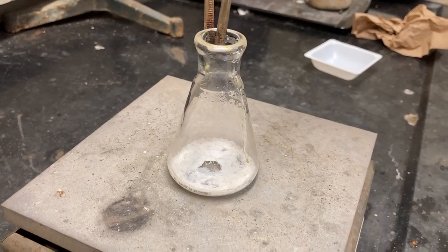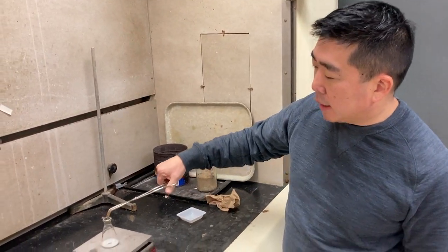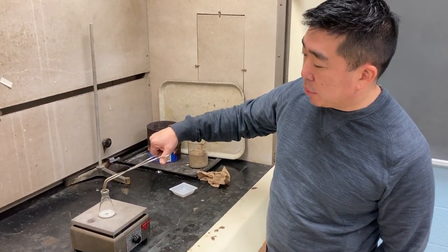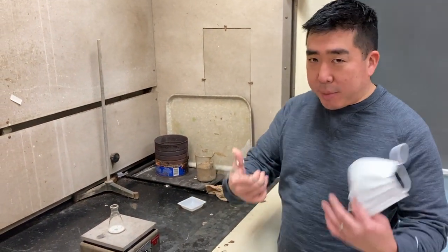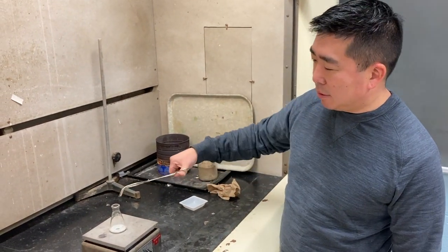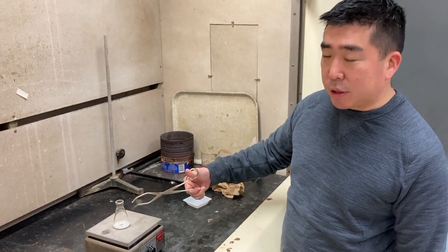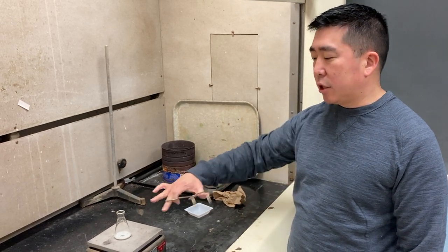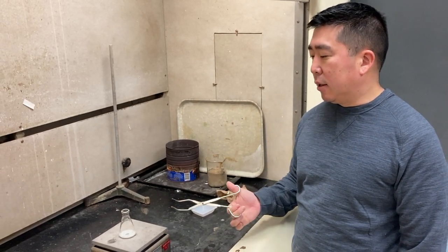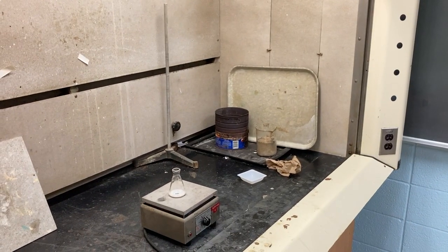Wouldn't they just dry if we kept it on the plate? You know what? In a normal lab environment, we would be drying this over a hot plate or a Bunsen burner, but that's because in a normal period we don't have that much time. With the magic of time-lapse video filming, we can take this nice and slow, and we'll get better results this way if we just let it sit on the hot plate. That's actually a gentler way of heating it, and we should get better results. Okay, so we'll let this go for a few more minutes, and then we'll check it.